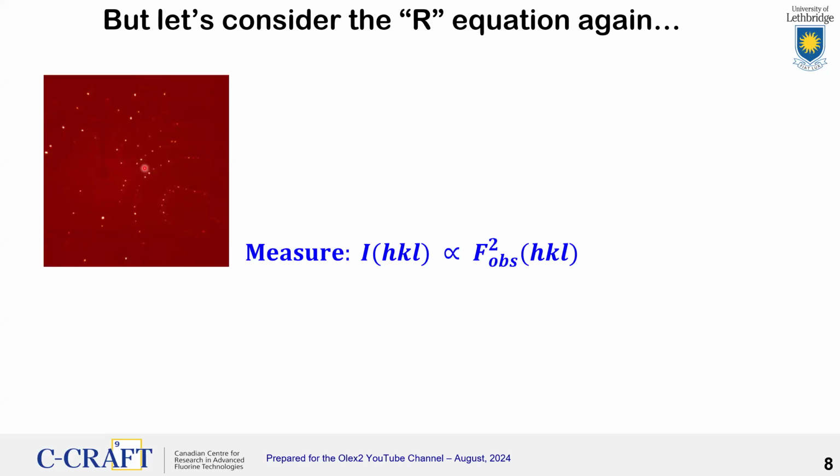Each of these spots on this area detector represents one unique scattered wave, which is identified by the geometrical indices H, K, and L, the so-called Miller indices, and that is tied into a geometrical formula, which I'm not going to go into the details of here, but it underlies the whole picture, greatly simplifying this. And each of these has a unique intensity associated with it.